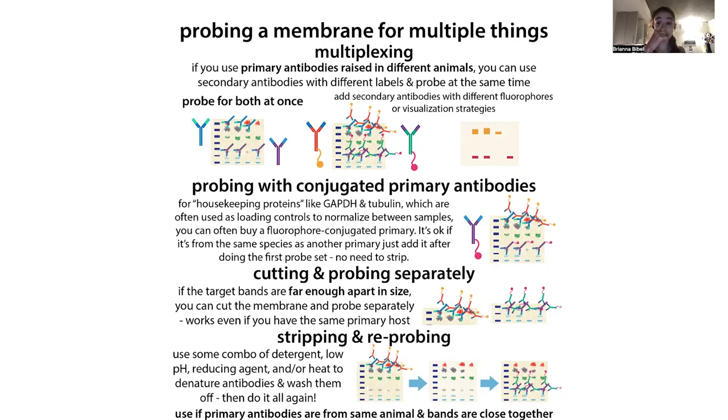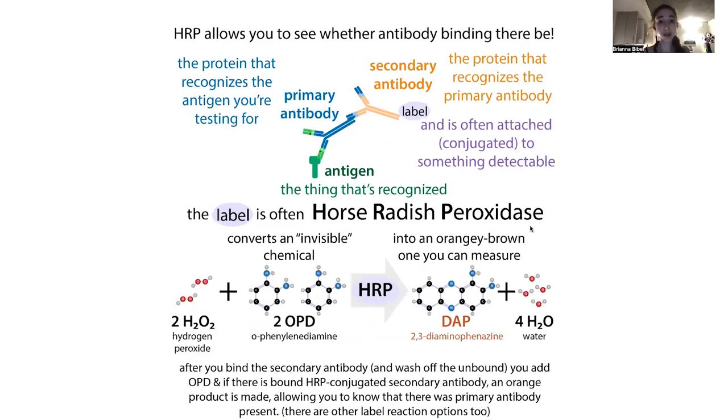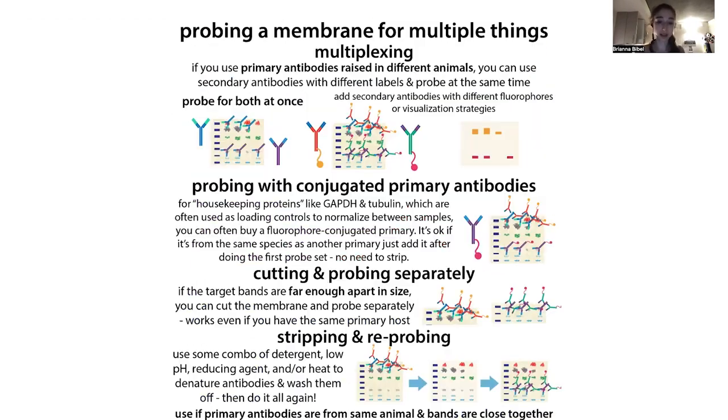Another thing, just really quick, is that we talked about, like I briefly mentioned HRPs, the horseradish peroxidase. If you're using that method, you can use hydrogen peroxide to inactivate the horseradish peroxidase that is conjugated to the antibody. So you can actually do that and then reprobe. But going back to, I'm going to focus more on just the methods that'll work for whatever. Okay, so that is if you do the multiplexing with that.